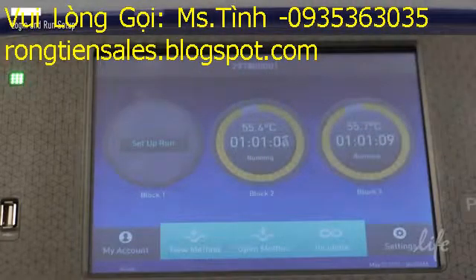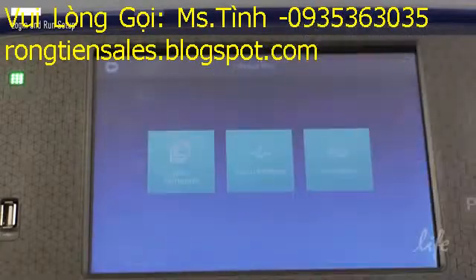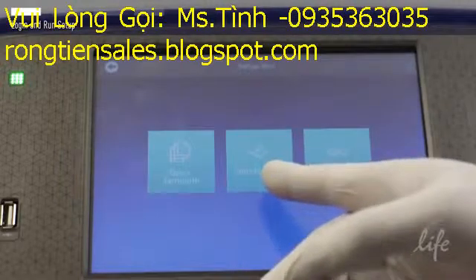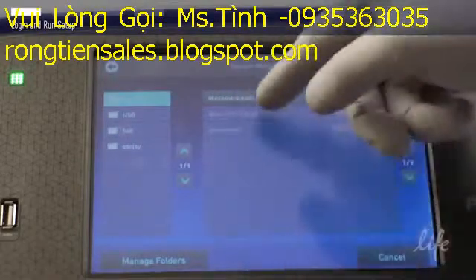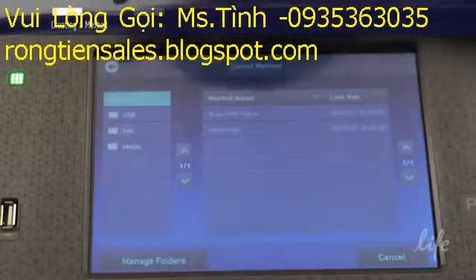As you can see in this example, blocks two and three are currently in use. Select an open block to begin programming your run. You can select using the open method option to access your own personal folder or look at methods from another user.